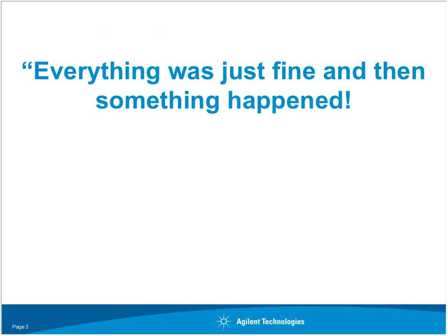So when we get into this, it was like everything was just fine, and then something happened. And this is very interesting. So what I will do is go away from some of the slides and share with you some personal experiences. I talk to customers every day on the phone, and every call presents a different challenge. So again, these are very timely phone calls we get. These are things that we monitor, things that we keep record of to try to help our customers with the same problems that come up from time to time.